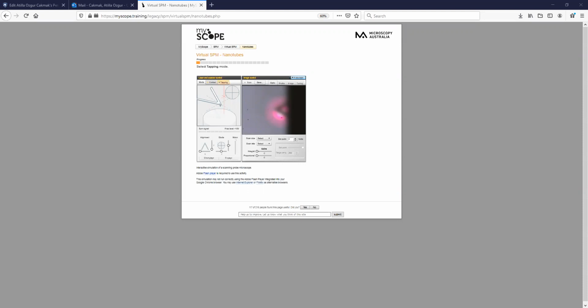Now we need to set a frequency range to identify the tapping mode's natural resonance frequency of the cantilever beam. For those folks who are already familiar, they will immediately recognize what I'm doing right now. I'm trying to sort out the natural resonance frequency of the AFM tip.